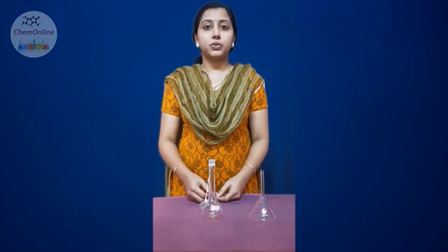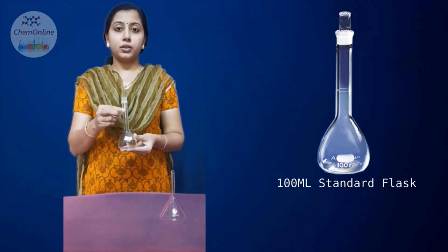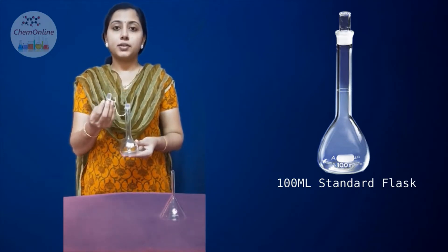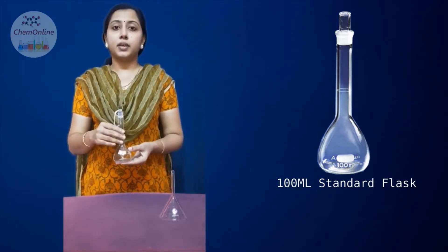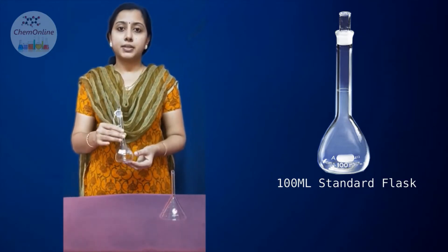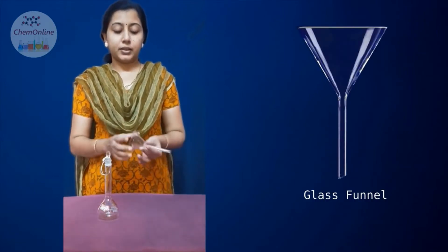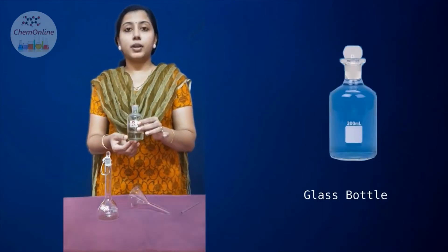First, let us see what all things we need to prepare or make up a solution. We need a standard flask, which has a flat bottom and a long neck, and is provided with a glass stopper. The standard flask may be of different capacities like 100 ml, 250 ml, 500 ml, etc. Here we have taken a 100 ml standard flask. We also need a glass funnel and a glass rod for transferring the solution, which will be provided in a small glass bottle.